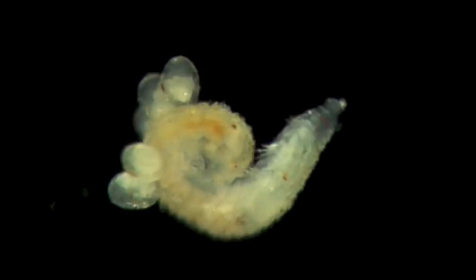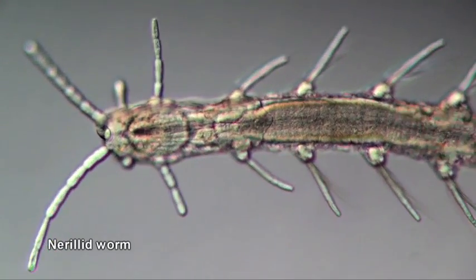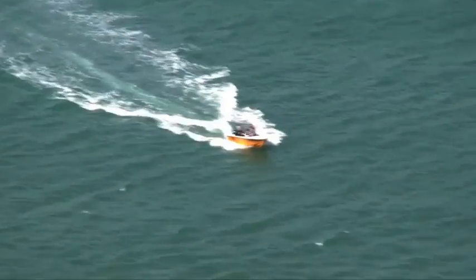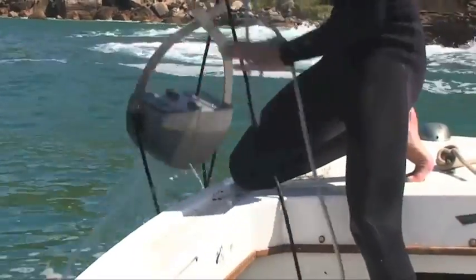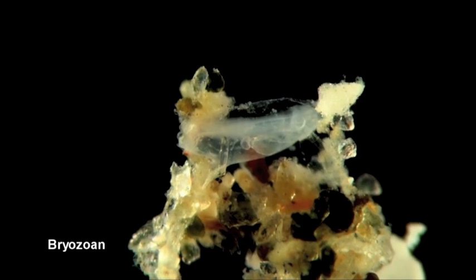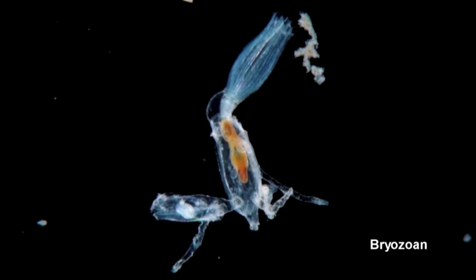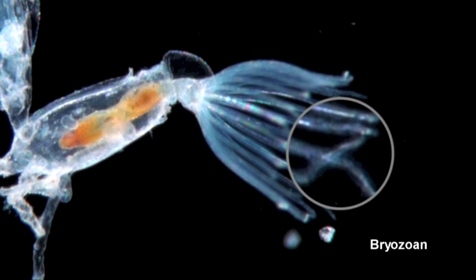The observation of live material under the microscope allows us to see many of the essential morphological adaptations needed to inhabit and survive in this environment, an environment paradoxically large with many tiny interstitial spaces. For instance, in habitats subjected to strong water currents, where gravel, shell, and coral fragments prevail, some organisms attach to the grains. This life strategy allows them to capture suspended particles or prey upon other small animals without being dislodged by the water movement.